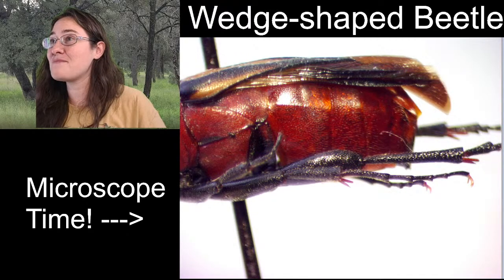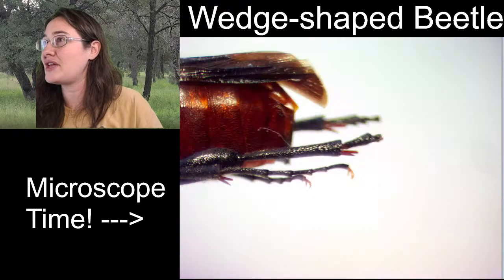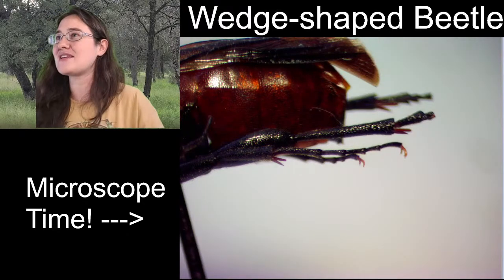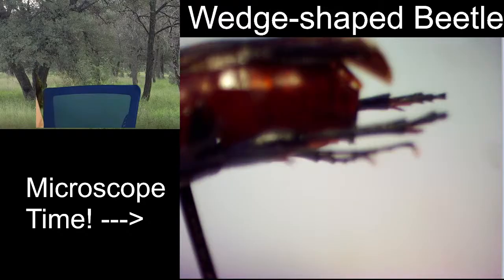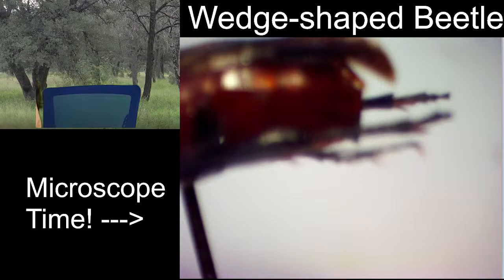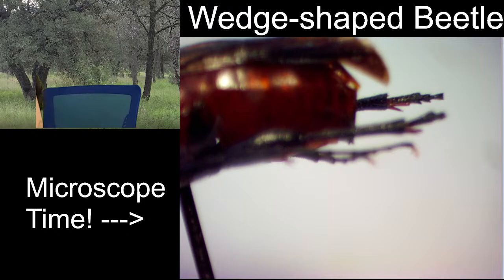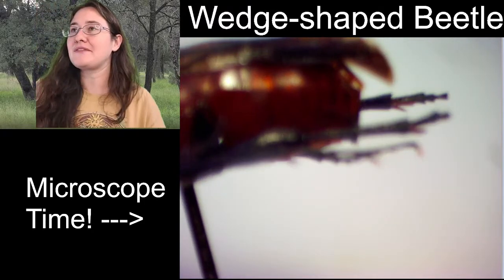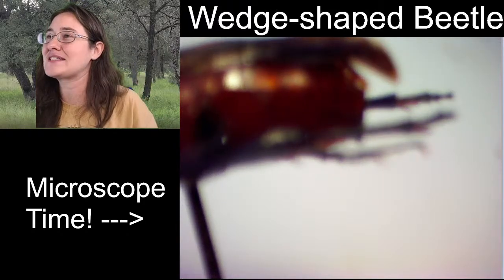Now, the femur kind of looks bulbous in both directions on the hind leg. Oh, no. Now, my question is, is that the natural end of the leg, or are there missing toe segments? Guys, I think that my beetle is missing toes. Sorry about that. It doesn't look like either side has a full set in the hind legs.